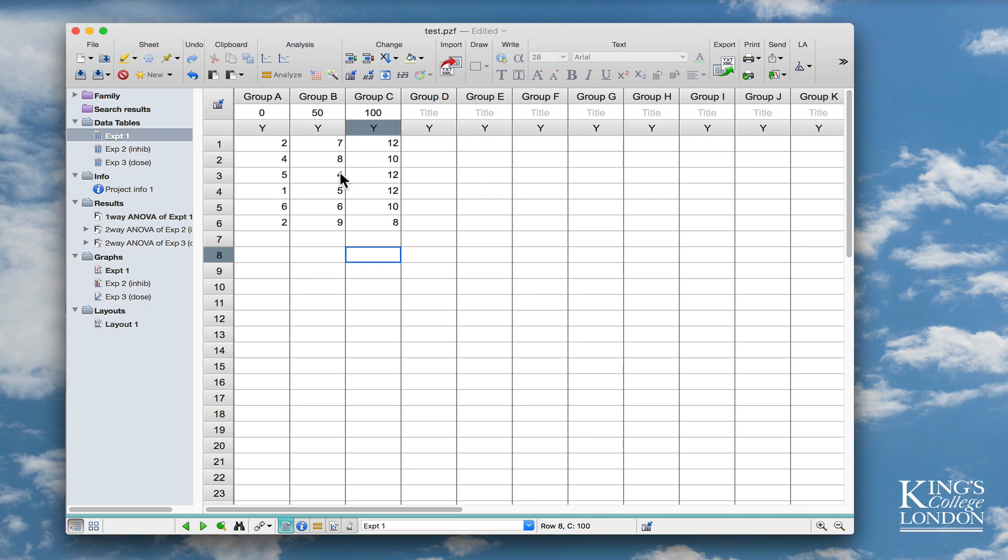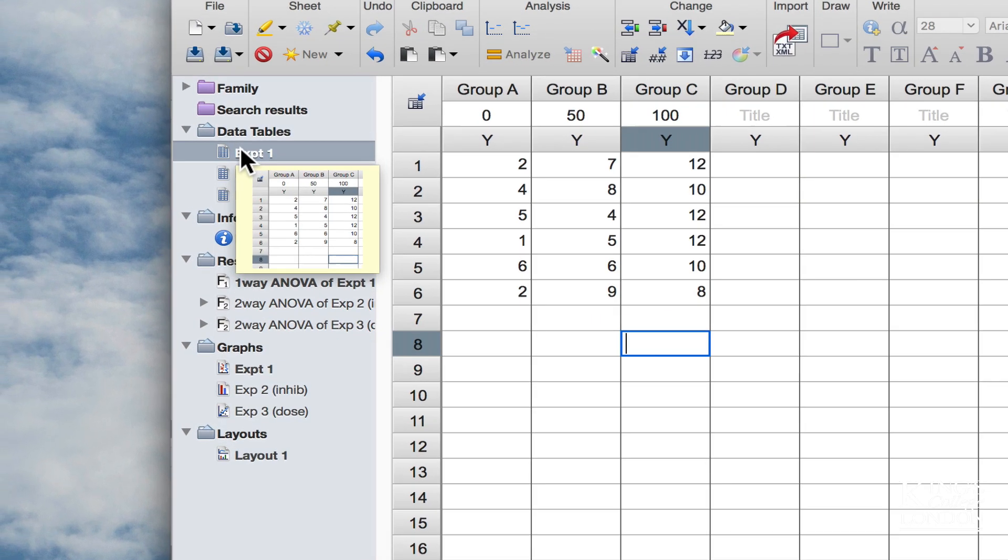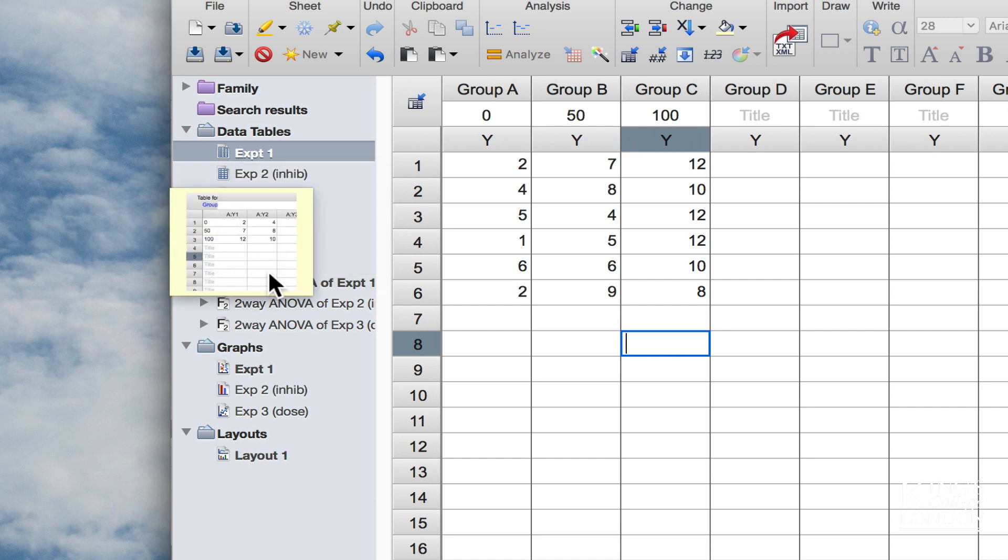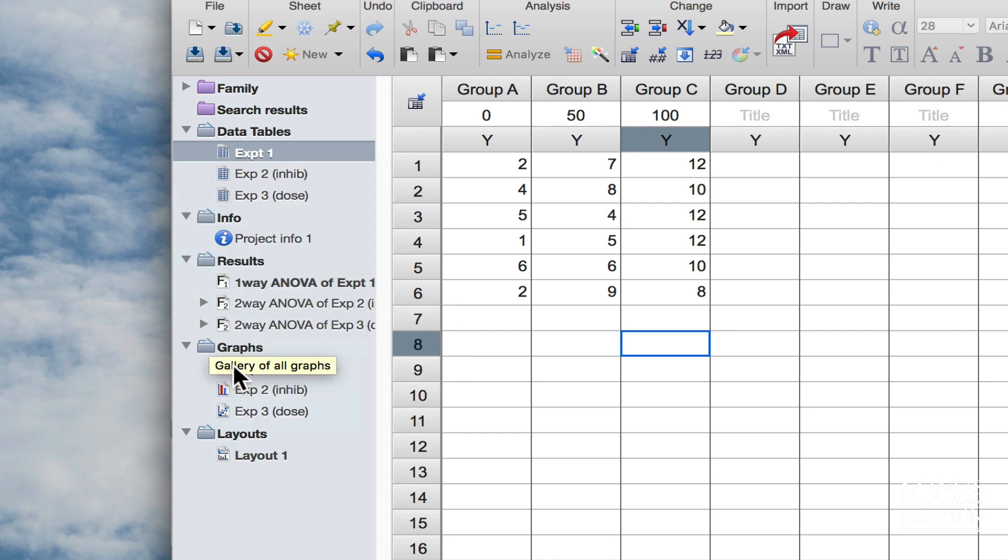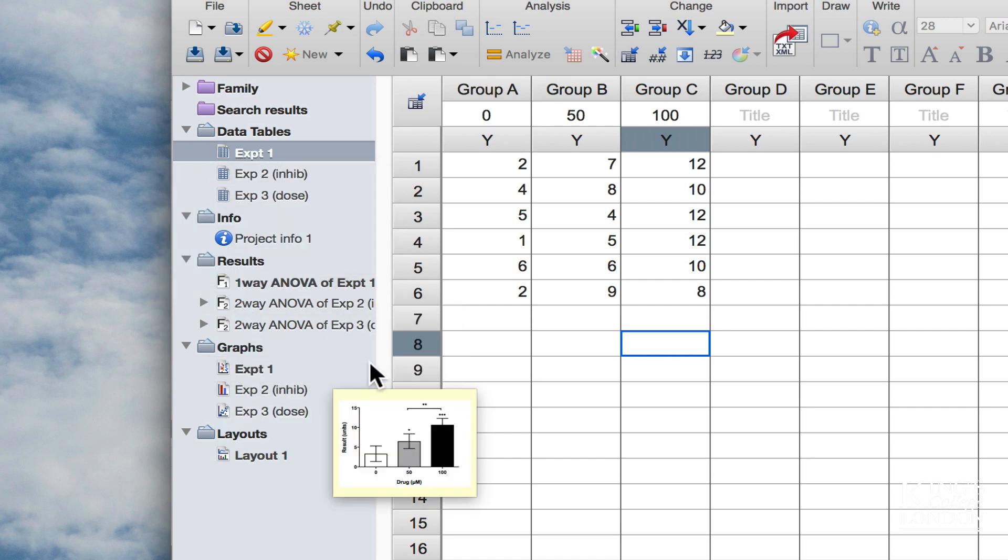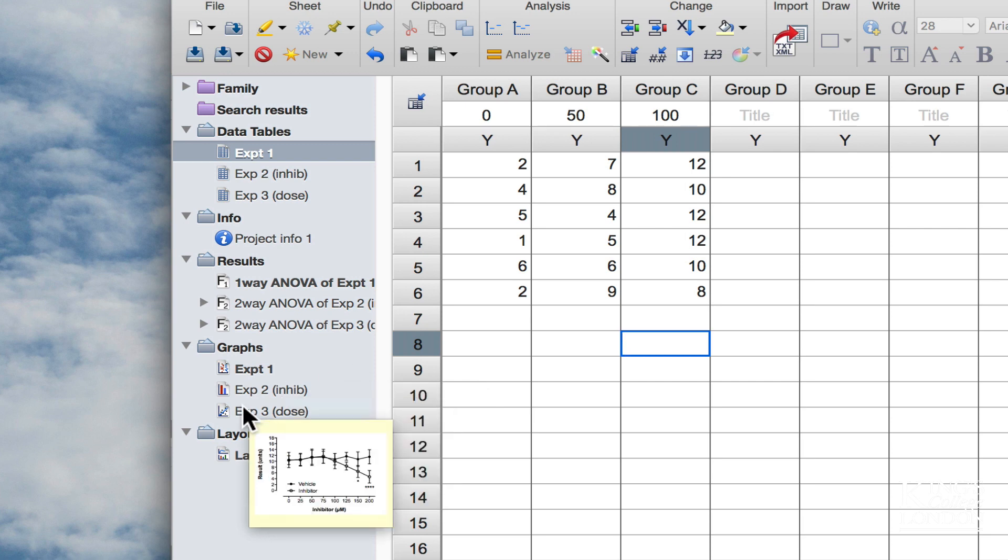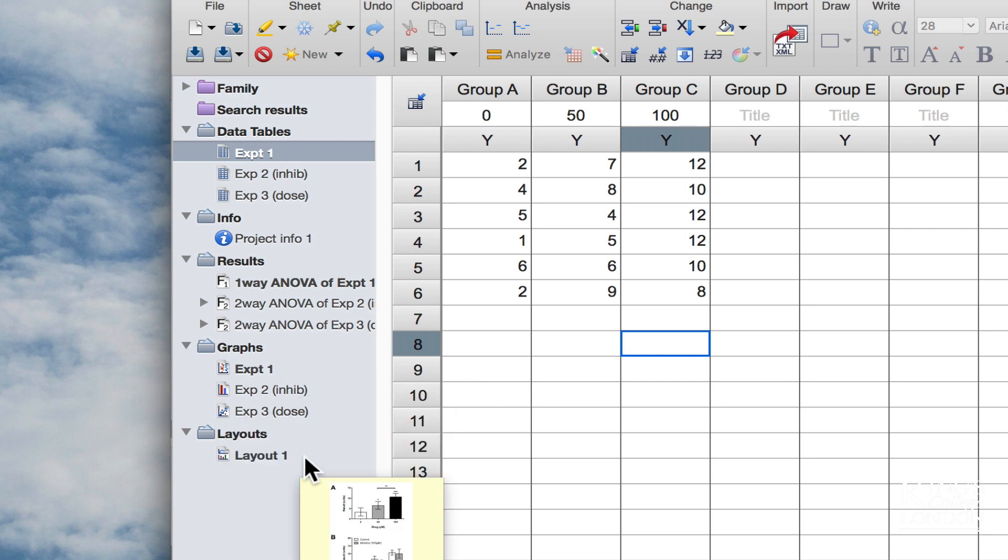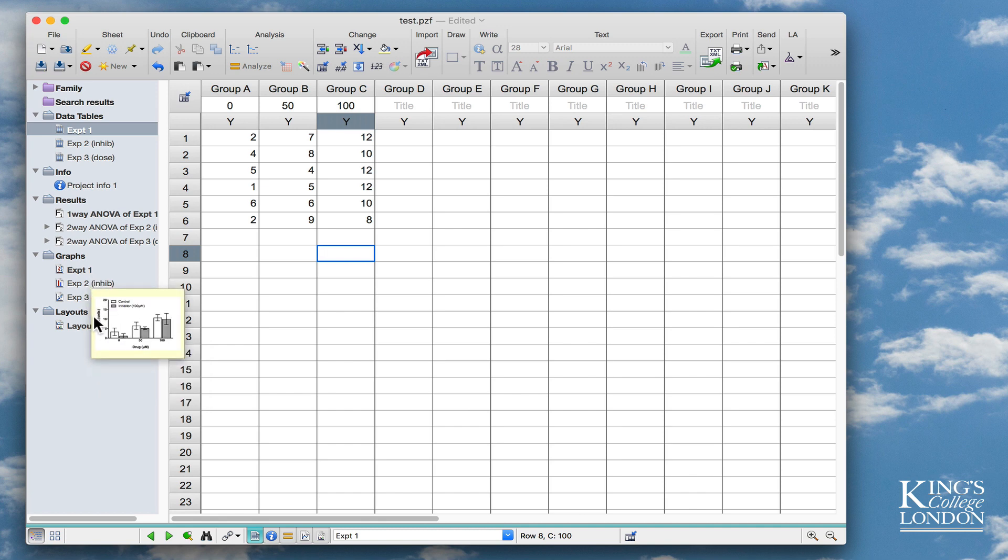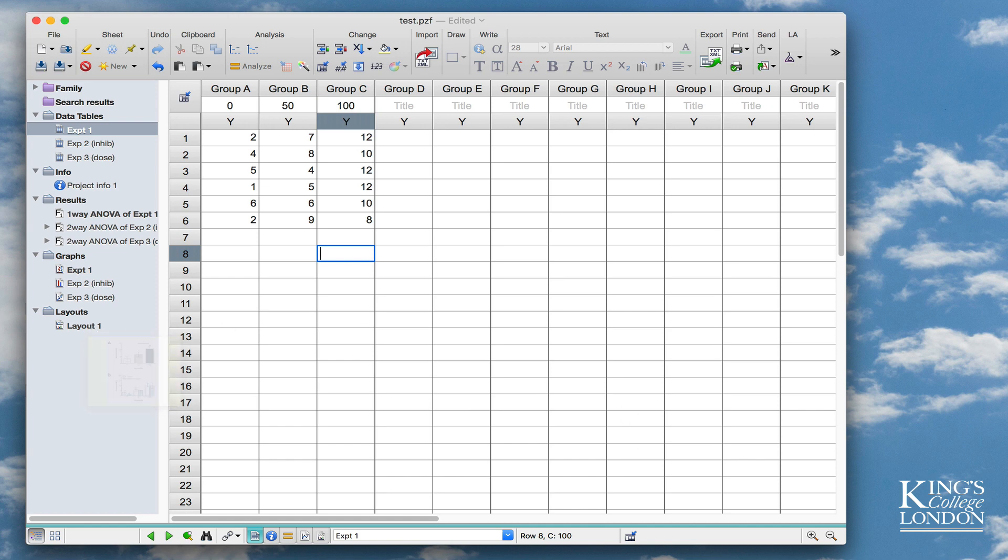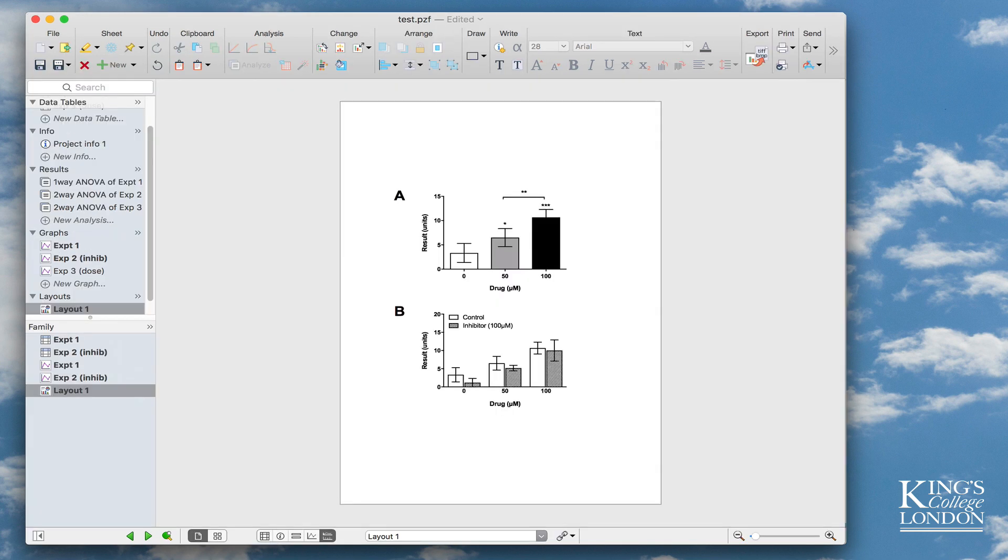Now you'll notice since I've selected experiment A in my data table, the results of the analysis for experiment A, the graph for experiment A, and the layout which contains experiment A data all appear in bold, so I can then track through to find out where these data appear in Prism. With version 8, which I'm switching to now, we have a very similar layout. The same file appears to be on the screen.